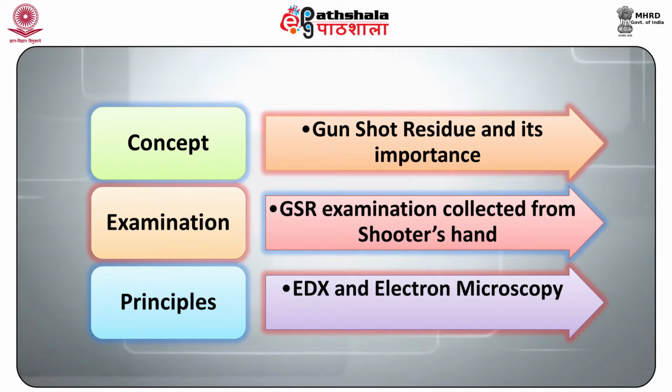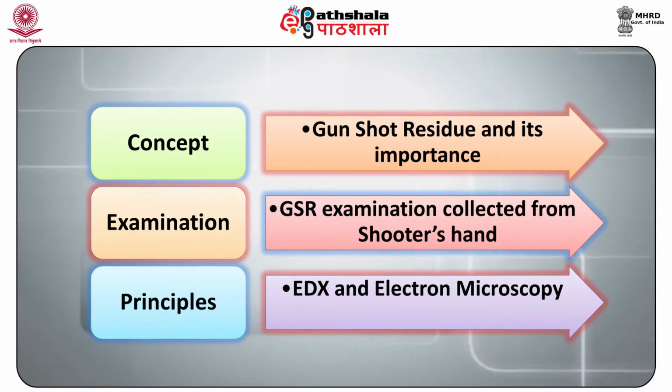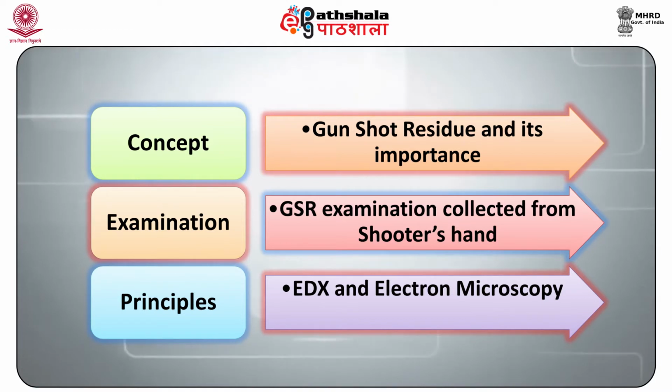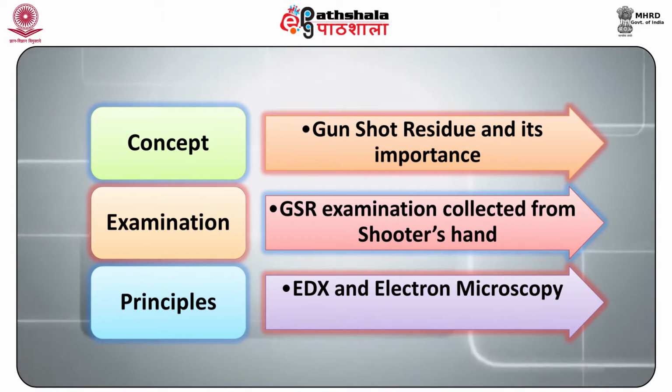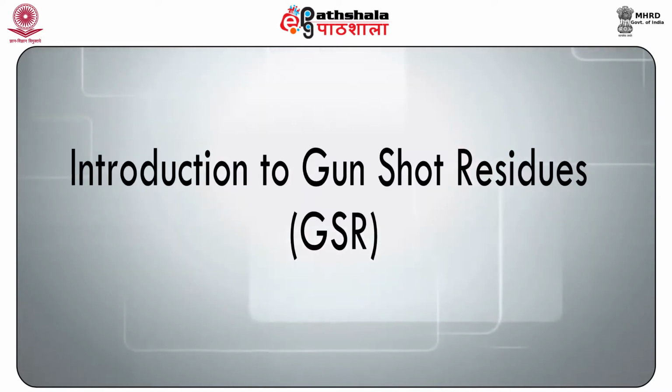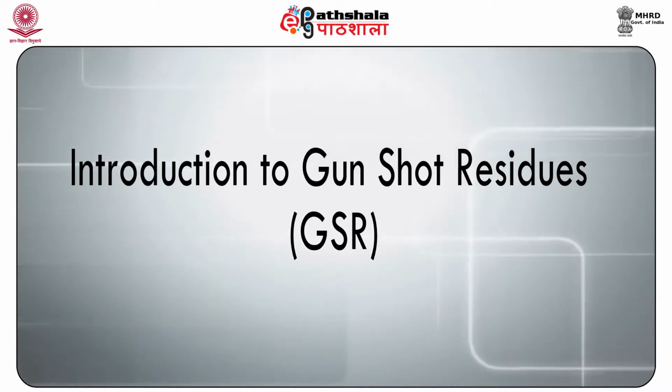Dear students, after studying this module, you shall be able to know about the basic concept of gunshot residue and its importance. Along with it, you will come to know about GSR examination collected from the shooter's hand, and you will learn about the principles of EDX and electron microscopy. Let us start with the introduction to gunshot residues.